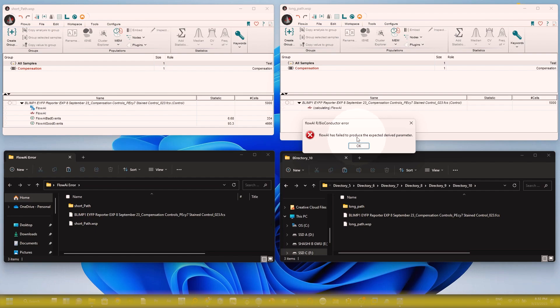These are the things I wanted to show you so you can understand why people get the FlowAI error in FlowJo software. You must save your WSP file and FCS file in a local directory using the shortest possible path in your system, and you will be able to perform FlowAI cleaning without error. If you are still facing this problem after trying this, please let me know and I will help as much as possible.